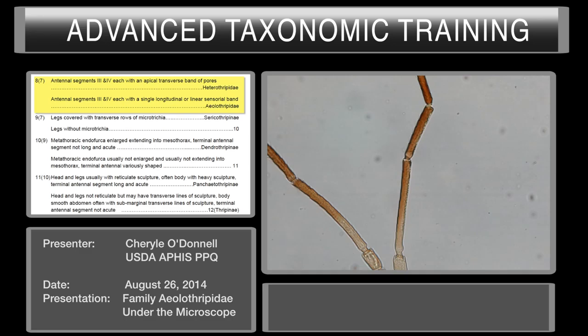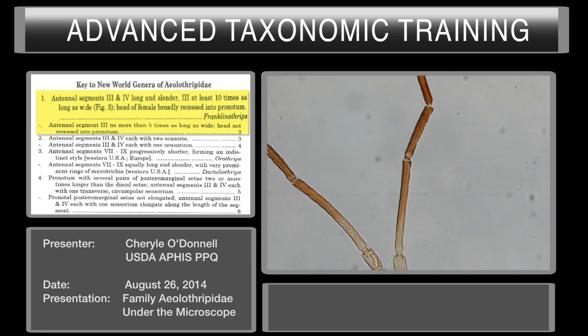So that will take us to couplet number eight on the key. On couplet number eight you have the choice of transverse or longitudinal. We've already decided we have longitudinal sensoria on these segments, so we have keyed to Aeolothripidae. That will take us to our next key, which I have printed out for you.